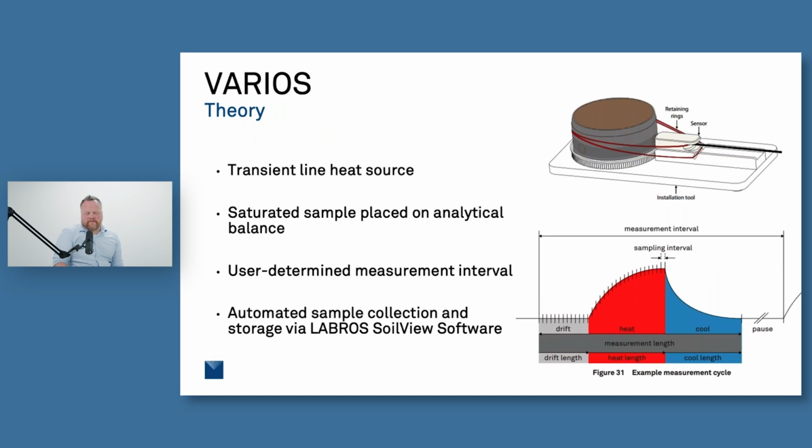I have a couple of images here for you to see also the insertion of that sensor. We have a tool that helps you insert it correctly into the soil, because the contact between that sensor and the soil is going to be very important to getting you good results. One of the things that we had seen when doing measurements with our other thermal conductivity sensors is that if the sensor is moved during insertion, it creates these gaps which give you really bad data.